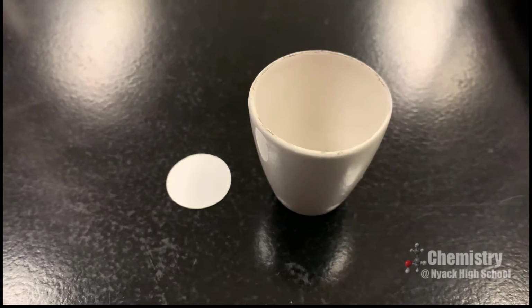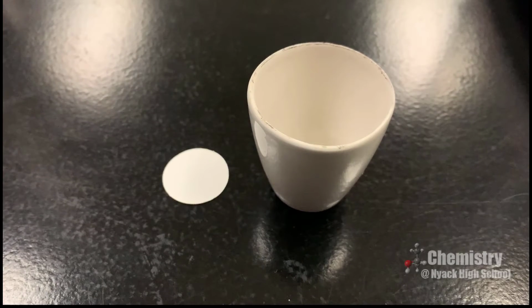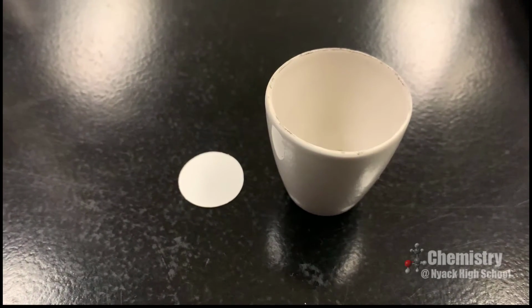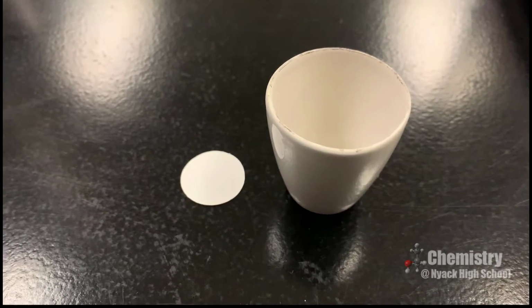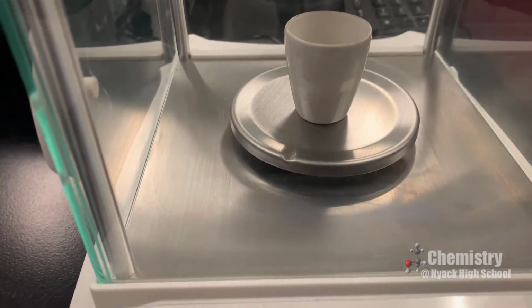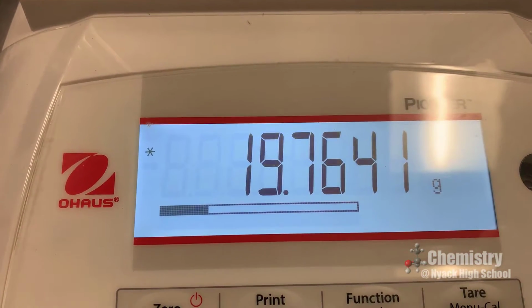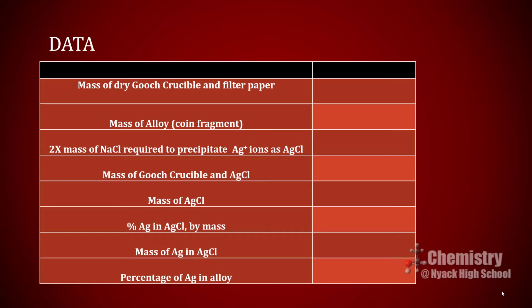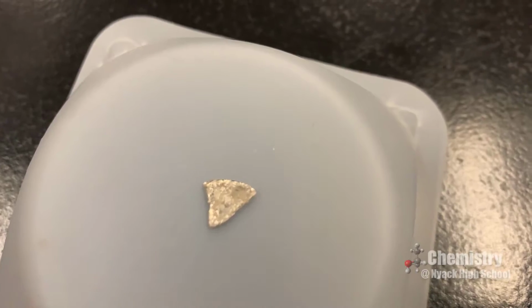Since we will be collecting the silver chloride as a precipitate by vacuum filtration, as before, we will need to obtain the mass of the Gooch crucible and filter paper. So the mass of the Gooch crucible and filter paper is 19.7641 grams. So we'll need to obtain the mass of the silver fragment.